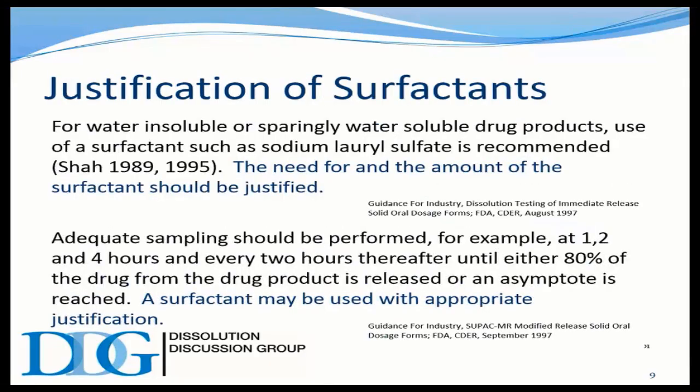Just to give a couple of regulatory references to this, we find this in guidance for industry. This generally is a window into FDA's thinking on any particular topic. One that's mentioned is on dissolution testing of immediate release solid oral dosage forms. For water-insoluble or sparingly soluble drugs, use of surfactants such as SLS, sodium lauryl sulfate, is recommended, and these come from several publications, but primarily Vinod Shah. The need for and the amount of surfactant, however, has to be justified.